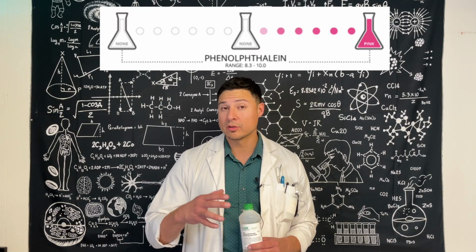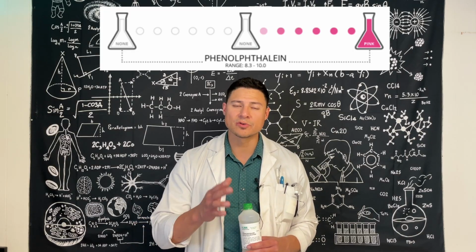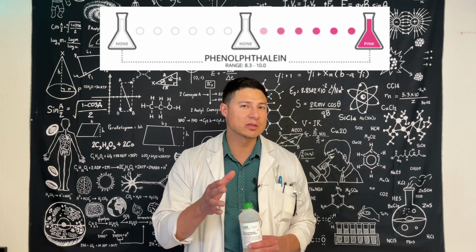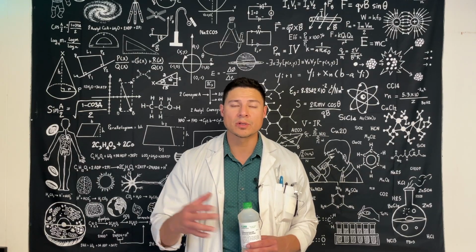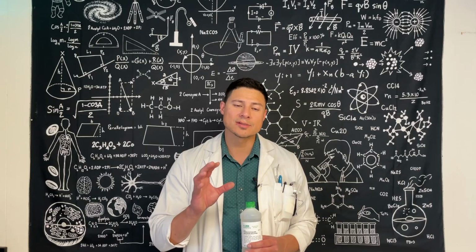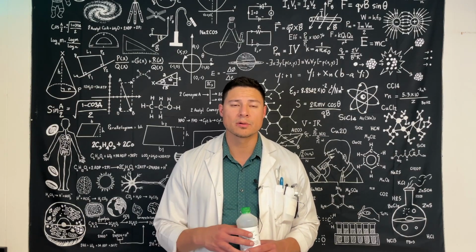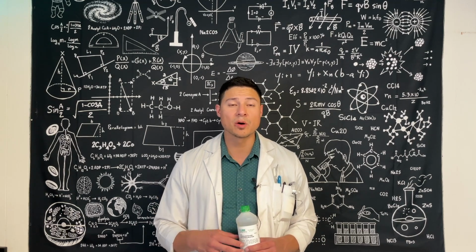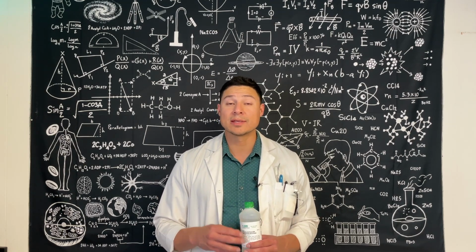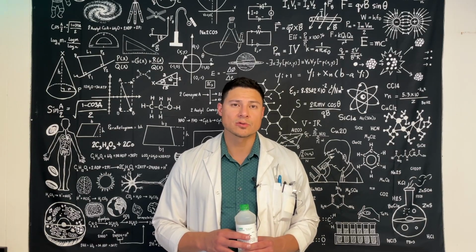Now, the darker the pink, the stronger the base. And there's different shades of pink, okay? It can be very clear pink or it can be very dark pink. So we want to use our observation skills carefully to try to see which metal is reacting more. Look for evidence of bubbles forming, maybe heat developing, and that sort of thing.